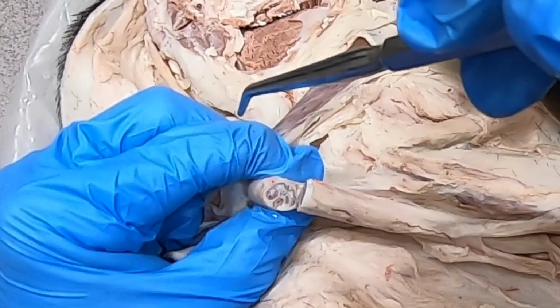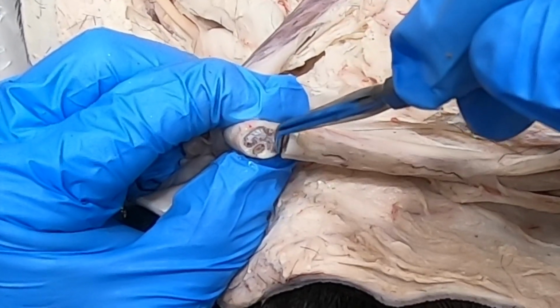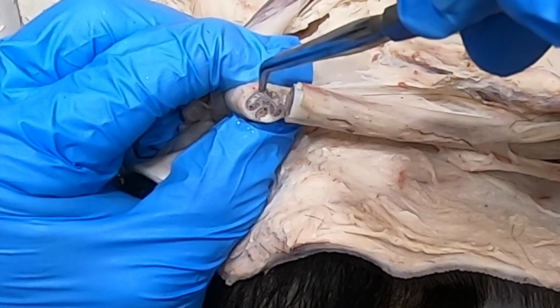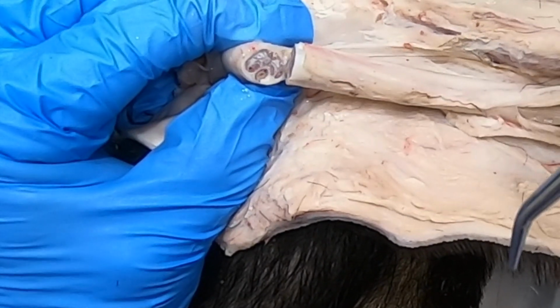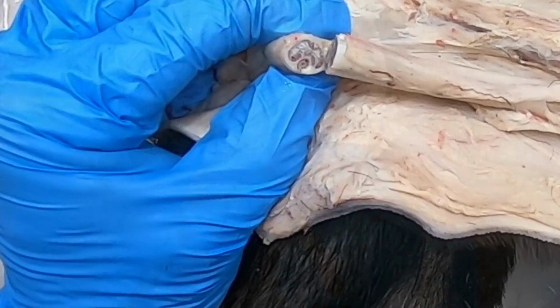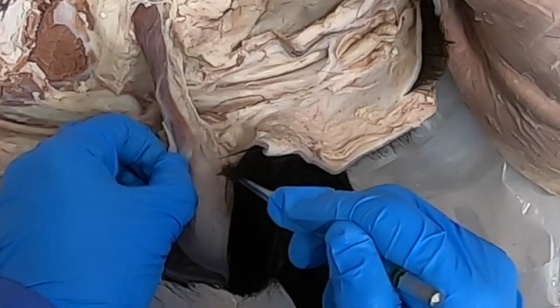So now I've transected the penis, and you can see here it's surrounded by a white fibrous coat, which is the tunica albuginea. It has the corpus cavernosum here, corpus spongiosum here, with the urethra right in the middle, just like all mammals.